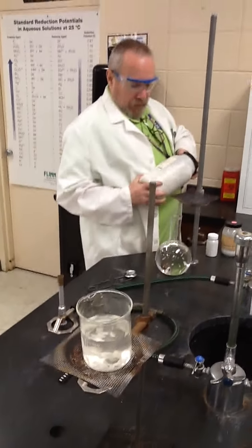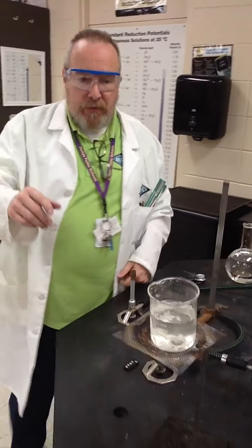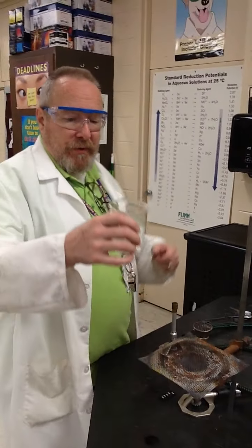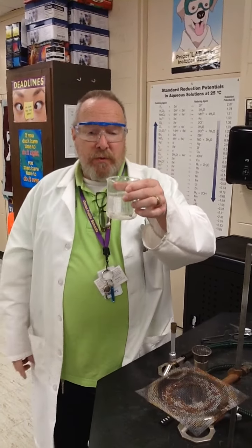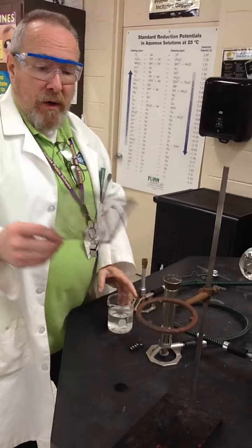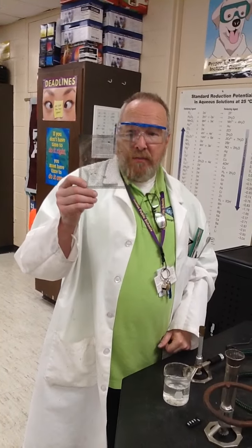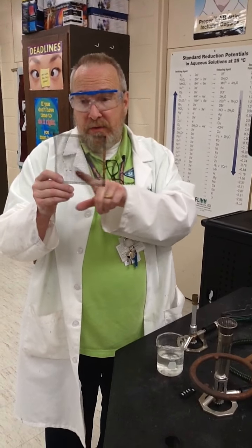So, what I'm going to do is take my beaker, and even though we use good borosilicate glass with a low coefficient of expansion, that is safe to heat, we don't want direct heat on it, so we diffuse that heat with a wire gauze. Sometimes you'll see these impregnated, some very old ones, which you should throw away, with asbestos.